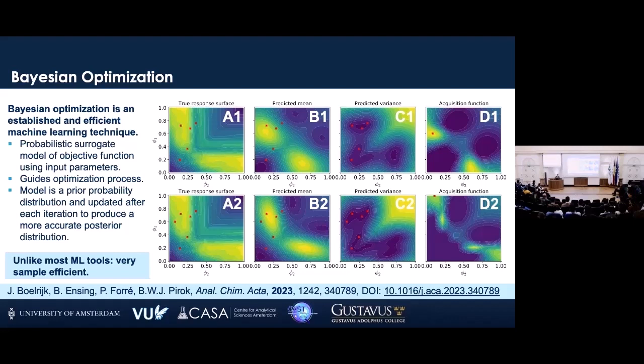Now I'm doing my scans, right? So I'm doing 5 methods, for example, these 5 red dots. So I picked 5 of these combinations, and then the algorithm is basically trying to establish what the actual score plot looks like, and it gets to this. So based on these 5 data points, it's able to map the surface this way, and it looks a little bit like this, but of course not enough.